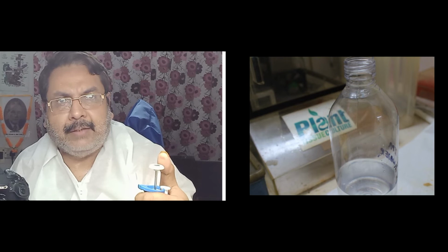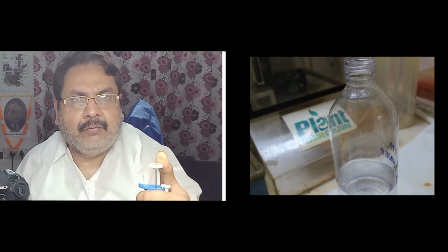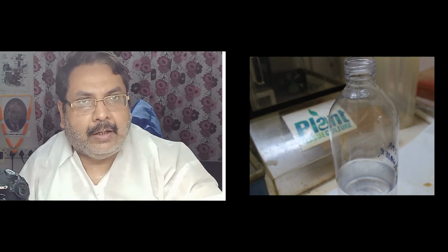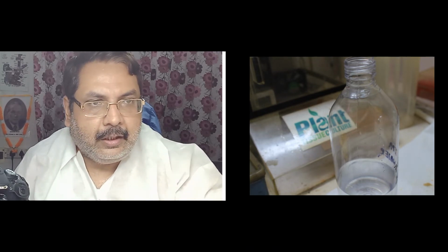So another auto pipette is there. This is a fixed volume auto pipette. This is also a 1000 microliter micropipette, but this is fixed volume. There is no volume changing knob. It has only a tip releasing knob and the plunger, the volume plunger, or you can say the volume taking up plunger, release and take up plunger. The same 1 ml pipette tip will be used. So this is all about it.